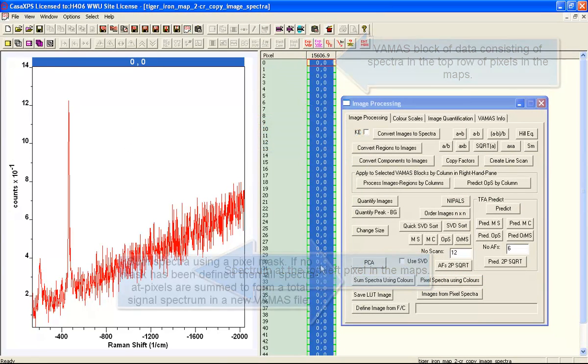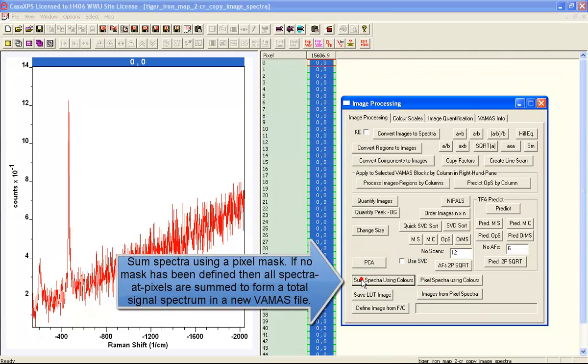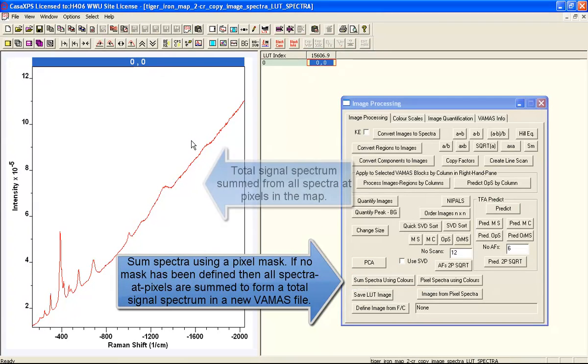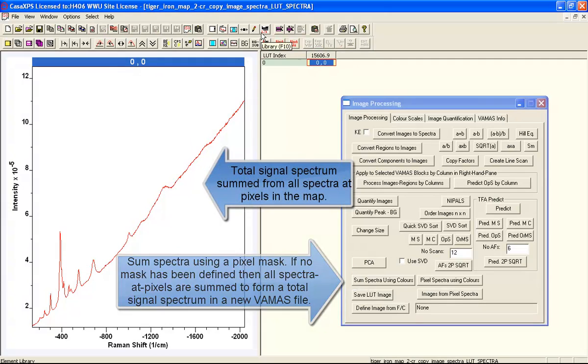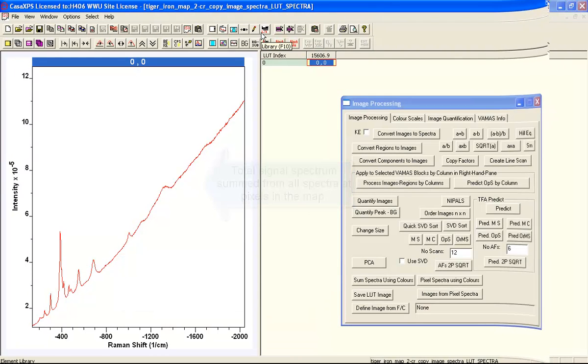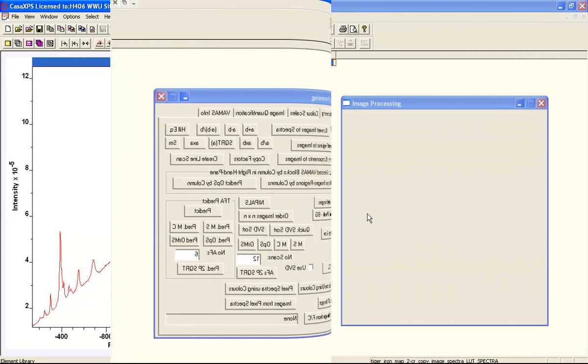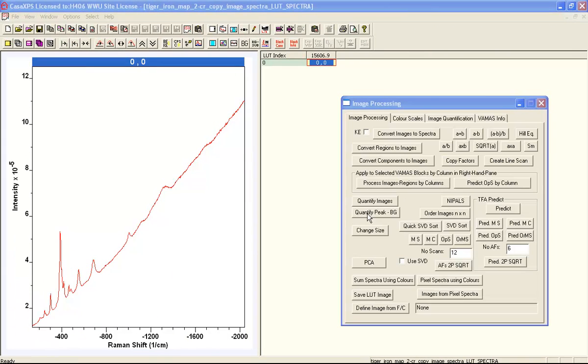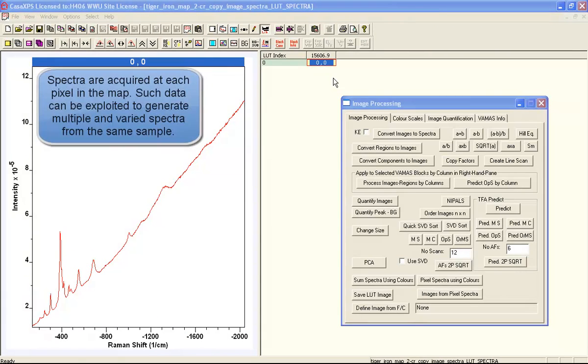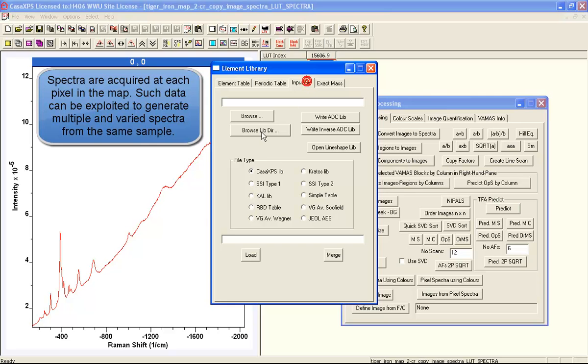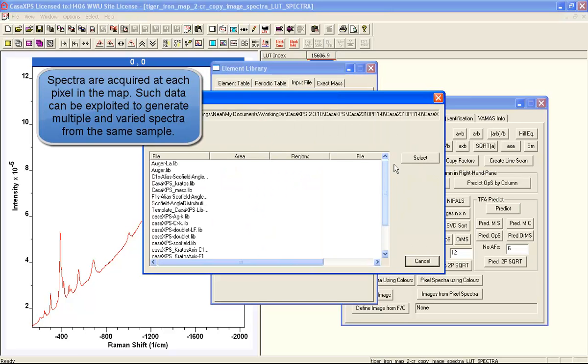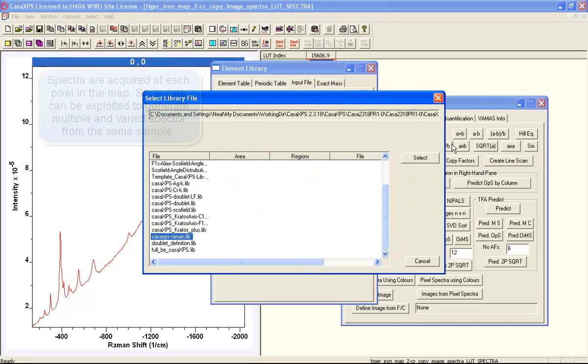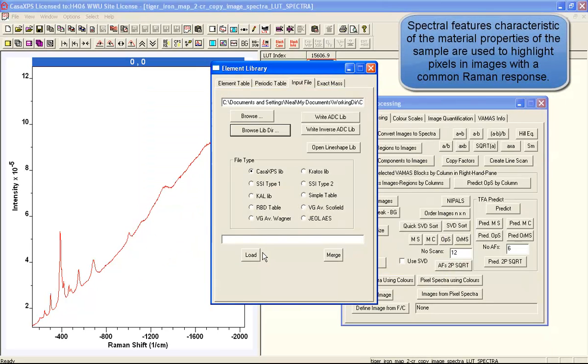These data sets may appear noisy on an individual pixel basis, but when you sum all the pixels in terms of spectra, you obtain quite a respectable signal-to-noise in a survey spectrum. The idea is that we're going to link peaks that you can see in the Raman spectra with pixels within a map.